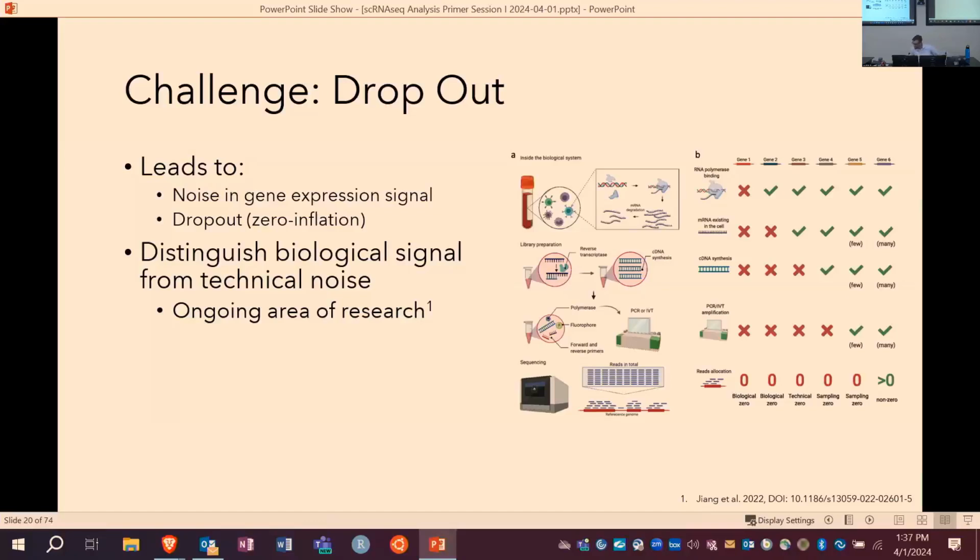So people have competing methods, and we'll cover it. Okay, so I see in the chat, sorry, I joined late, about getting to the markdown. If you follow the instructions on the first link, you'll need to start a DCC session, and then you'll need to pull the latest changes from the GitLab repo using the pull feature, which I think is outlined in one of the articles on the GitLab.